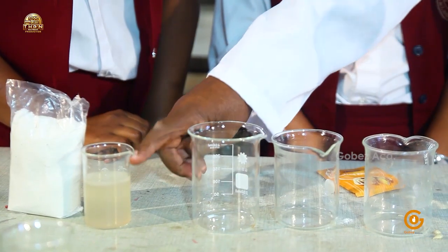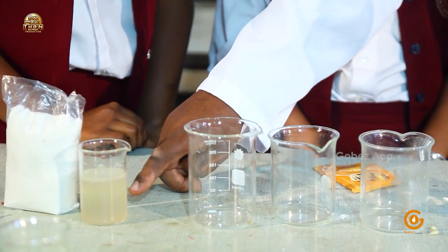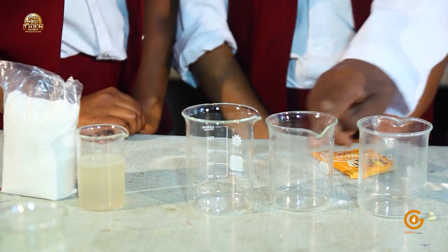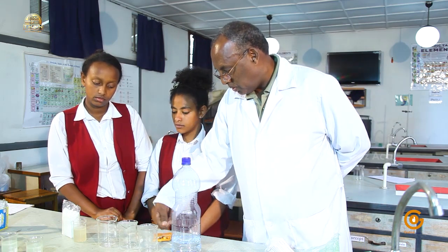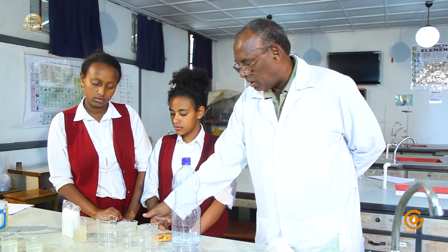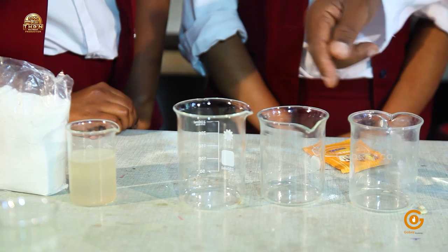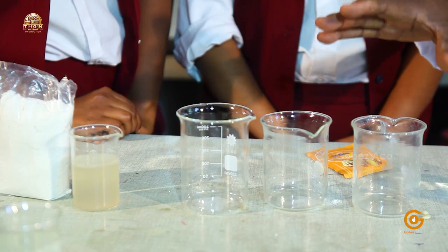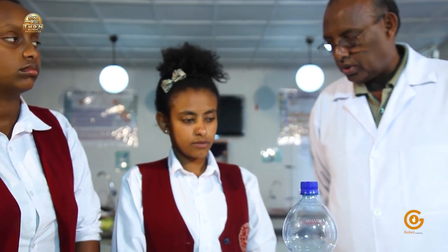And we have already seen how soluble ground sugar is in water. So we'll take the same volume of water in these two beakers, the same mass of these two solutes, namely sodium chloride and baking powder, and we're going to stir this for 2 minutes as we did previously with this one, and then we'll leave it for some time and then compare their solubilities. So ready to give it a start?